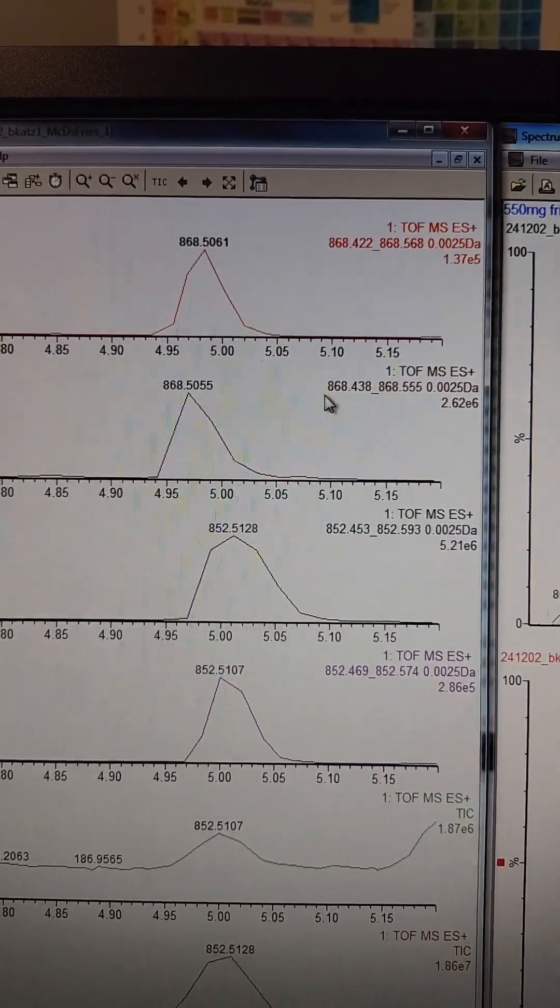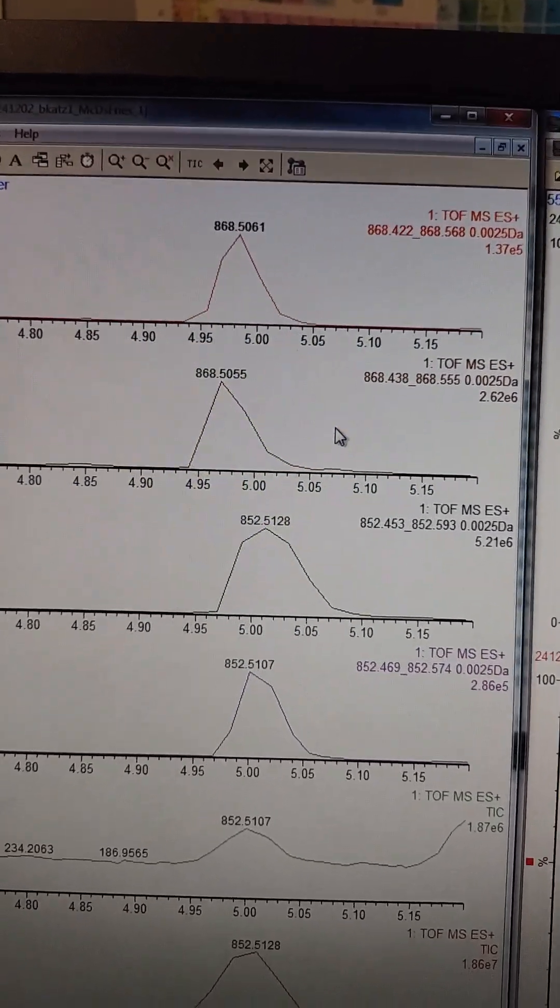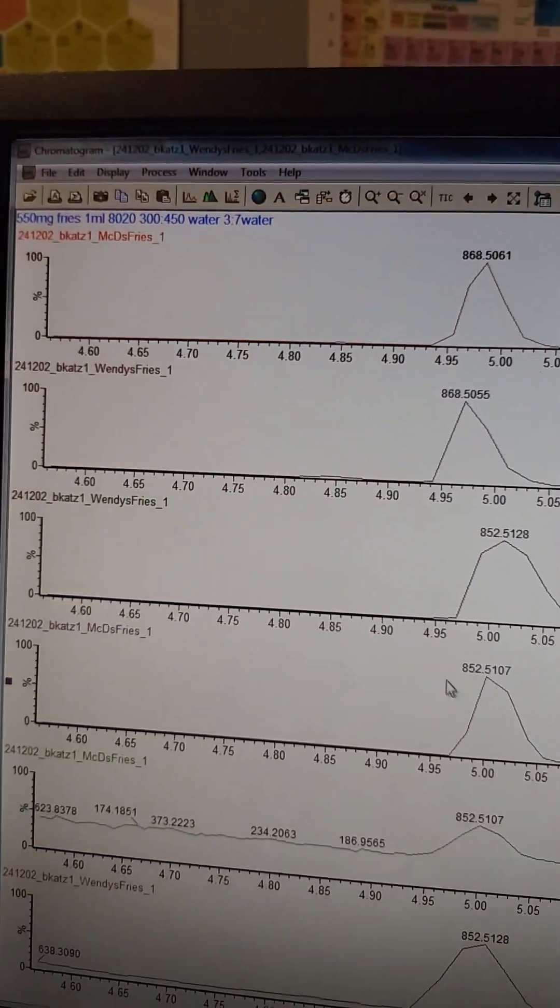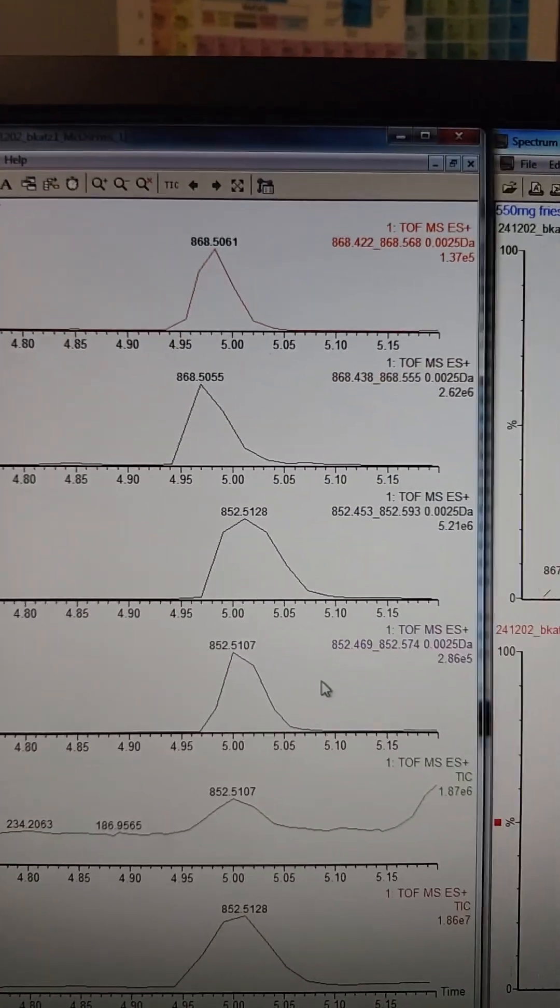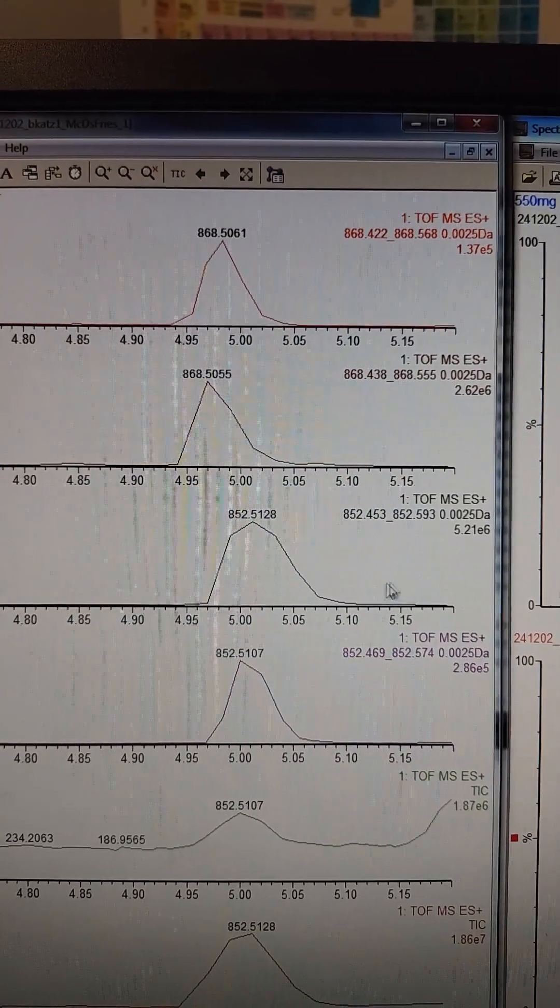I mean I don't know if we're linear here in this quantitation. But like as far as just empirically looking at this, there's almost none in the McDonald's.